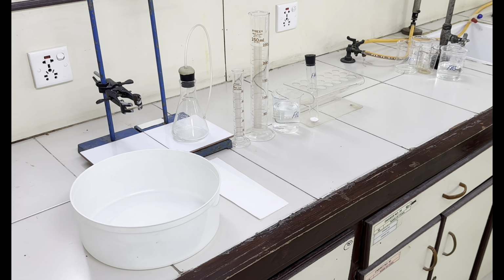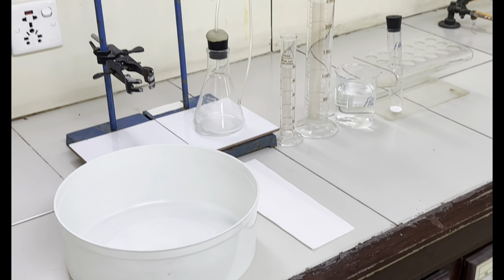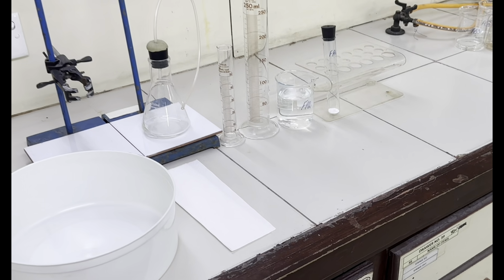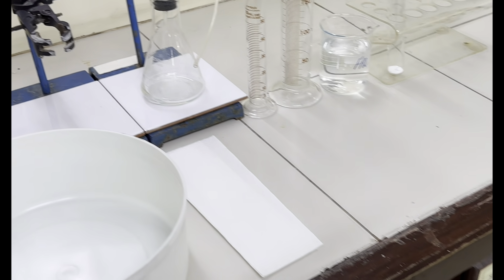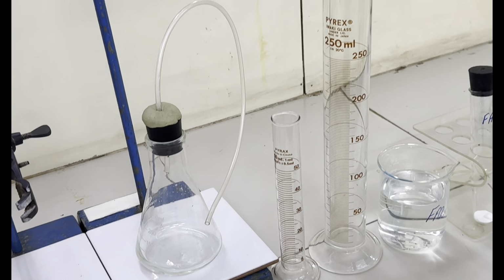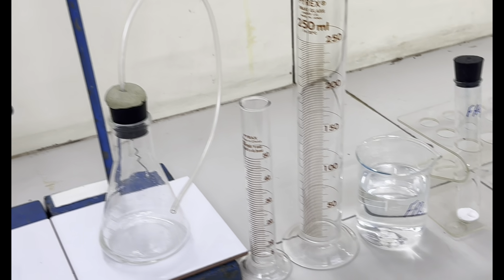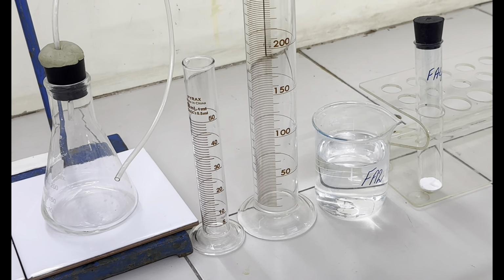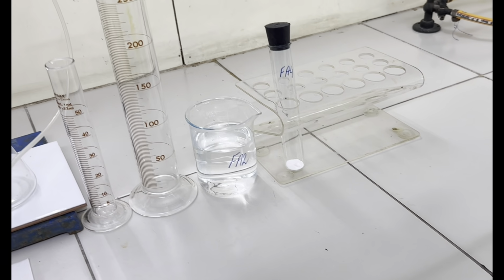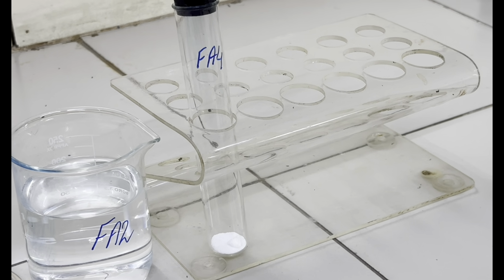Apparatus and chemicals include this water trough, 2 retort stands, paper towel, white tiles, a conical flask with a rubber bung with delivery tube passed and sealed, 50 centimeter cube measuring cylinder, 250 centimeter cube measuring cylinder, Fa2 solution, and Fa4 solid.